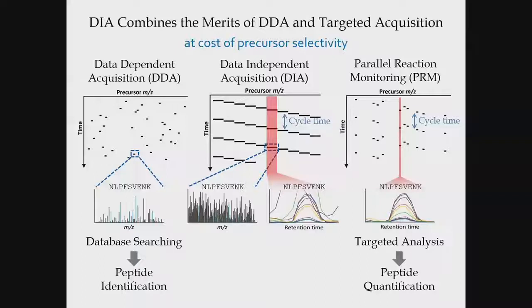You also won't get MSMS sampling continuously over time, so your ability to do quantitation at the MSMS level would probably be very poor. So we think about this predominantly as the data going into database searching, doing peptide identification, and most of the quantitation, with the exception of TMT, is done at the MS1 level. We can talk a little more about that later.